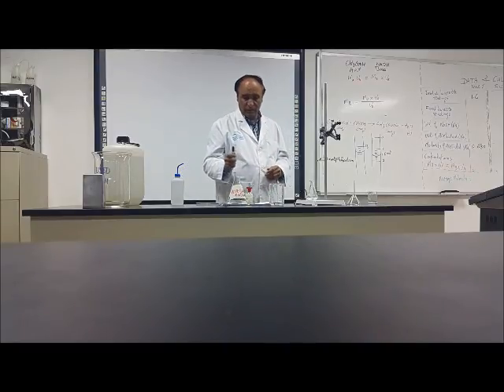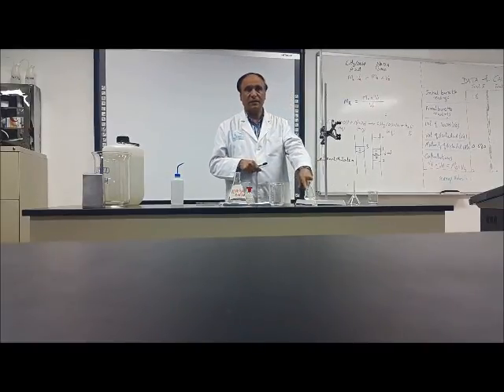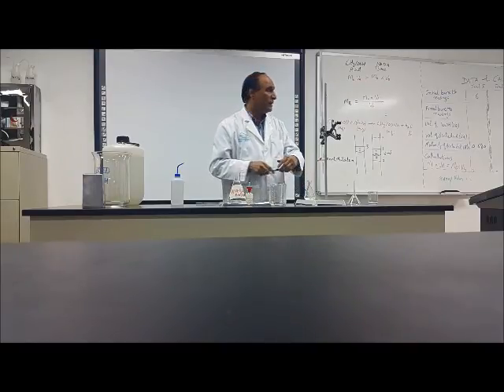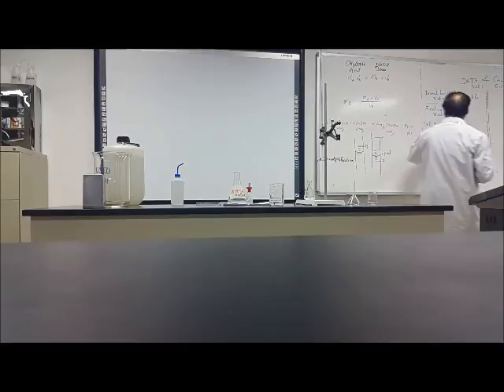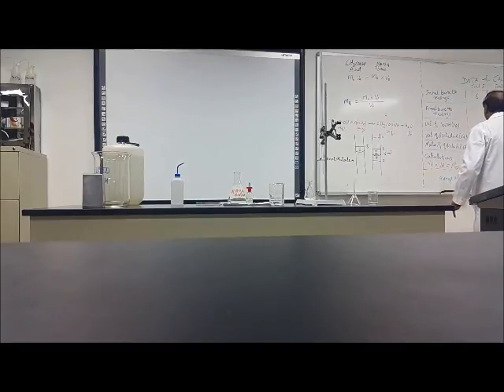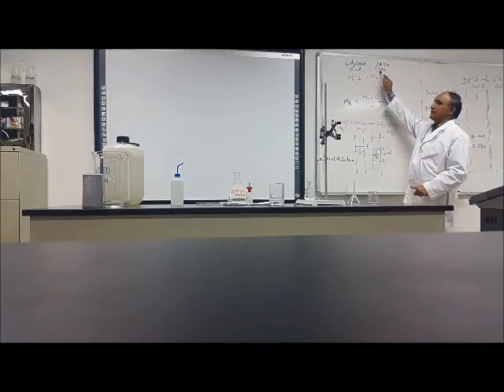I have here acetic acid. How much acid I took? 10 milli. So I will write volume of the acetic acid 10 milli. I know the molarity of the acetic acid, right? It's written there. Now I will do the titration. I have a very simple formula. This is acid equal to base.